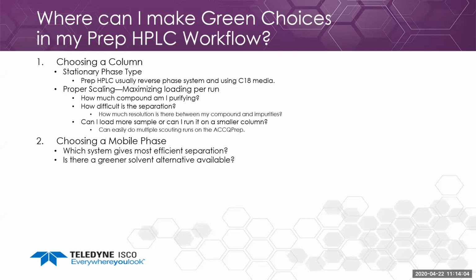Choosing mobile phase, you're probably already in reverse phase. So, you're in water methanol, water acetonitrile. Which system gives you the most efficient separation? Is there a greener solvent alternative available? Sometimes this comes into play with acetonitrile.